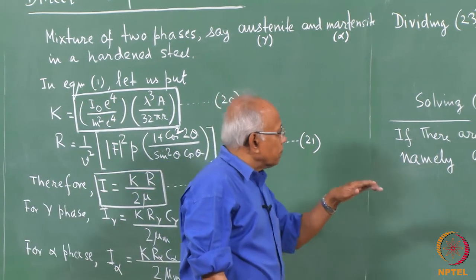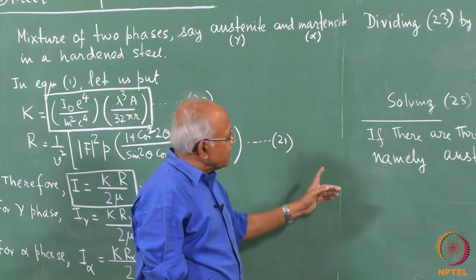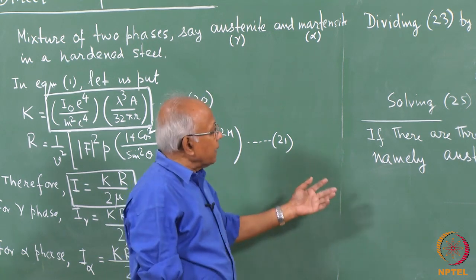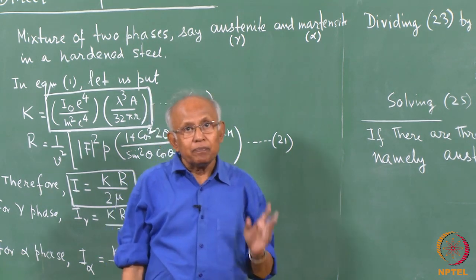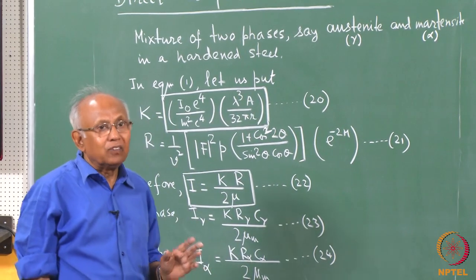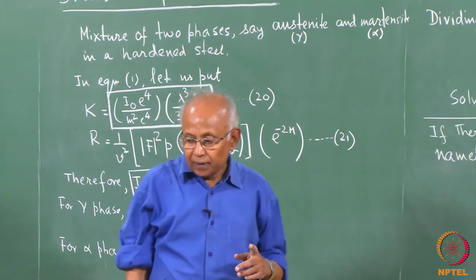But when it is below 15%, in that case the X-ray diffraction method using the direct comparison method can be a better proposition. So, this is the reason why the direct comparison method is very useful in industrial practice.